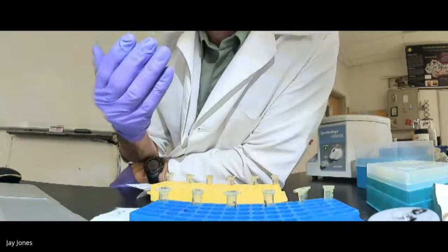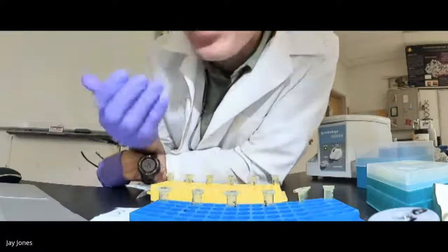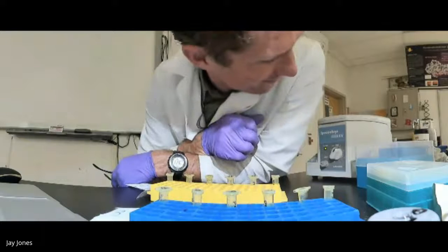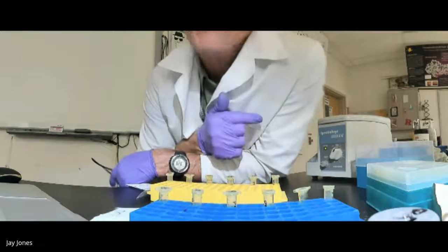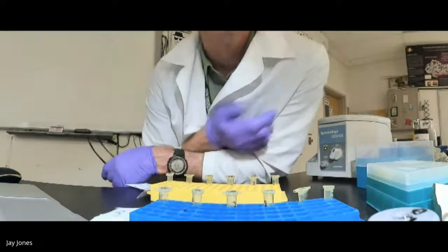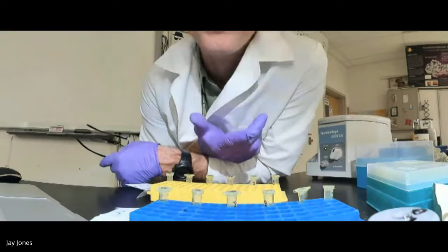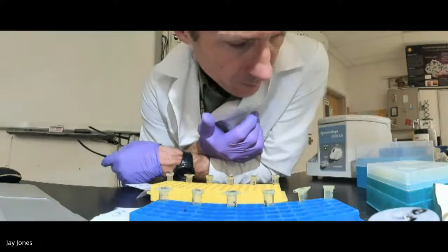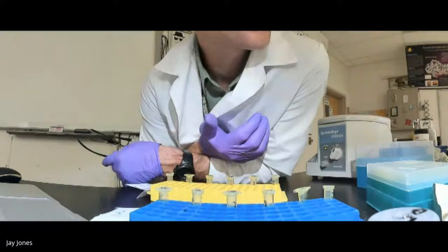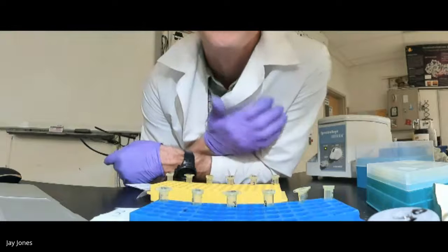So ethanol is going to do a great job here of washing the column, but it's not going to wash off the DNA. It's going to keep the DNA on the column. That's the whole point here. We don't want to wash the DNA off the column. I want to keep the DNA on the column, the plasmids, but I want to wash off the garbage. What's the garbage? I want to get rid of the phospholipids remaining that didn't go with the soap step. I want to get rid of ribosomes, enzymes, peptidoglycan pieces, sodium ions, other ions, denatured enzymes, other denatured proteins. Shoot, anything that these cells had in them except for plasmid DNA.